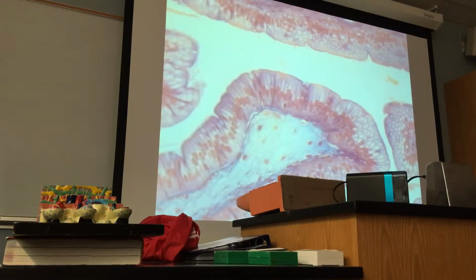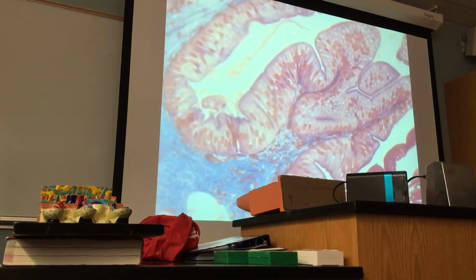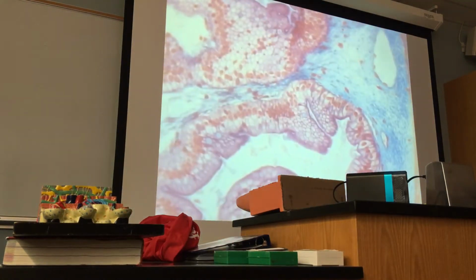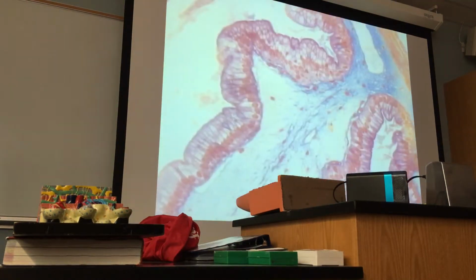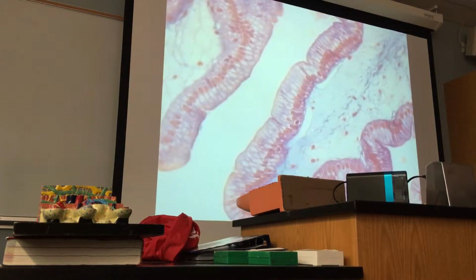This is one villus of small intestine, and these are the columnar cells, but you have to focus on the free surface. This is lumen, of course. This is a free surface. You can see a thick border. Maybe I need to go to another region. So it will drive you crazy, maybe, but that's all right.